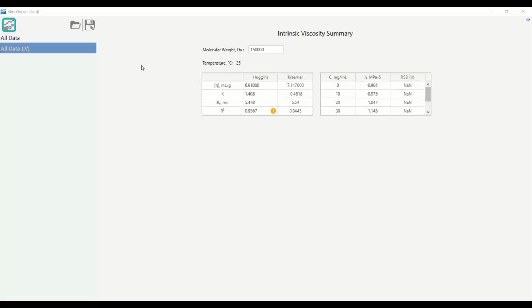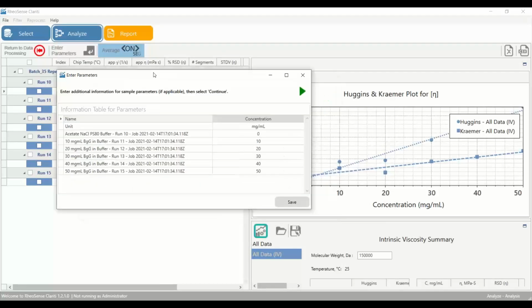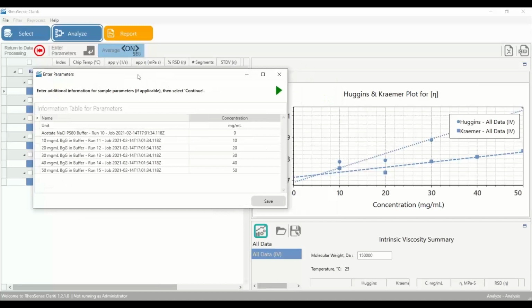Well, why is that? It's because I assumed that I was perfect and had the precise, clean concentrations there. So actually, I didn't have these concentrations. I had something slightly different from that. So I kept track of what I actually loaded into the vials. So it was actually 10.69, 20.18, 30.80, 40.43, and surprisingly, I did exactly 50, so that was lucky.